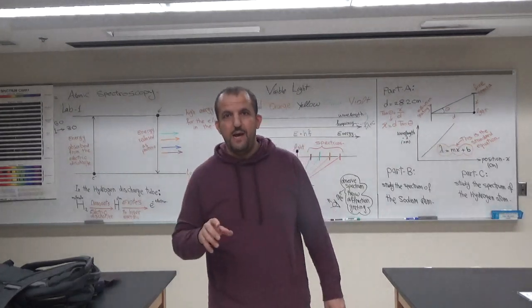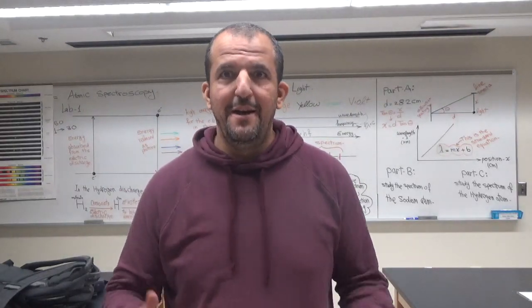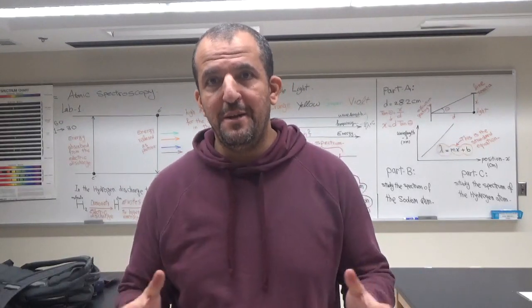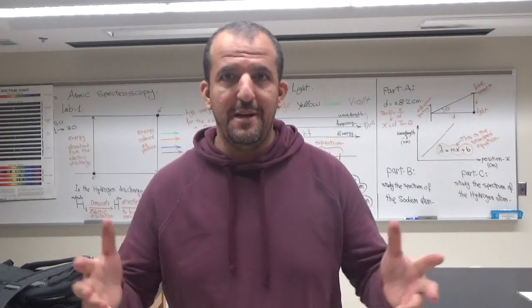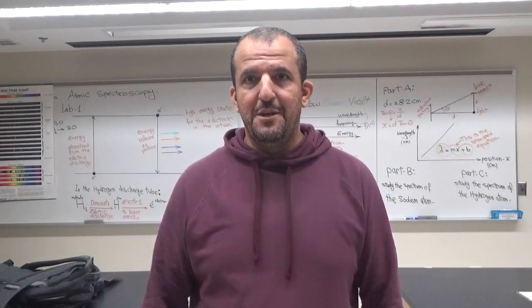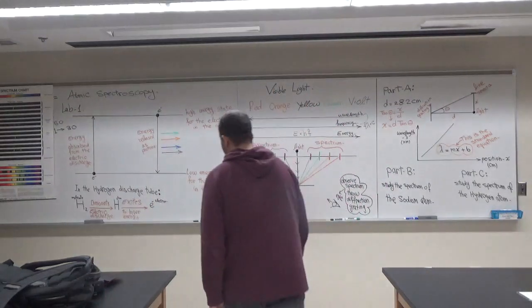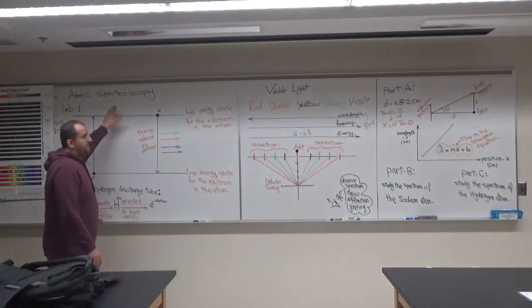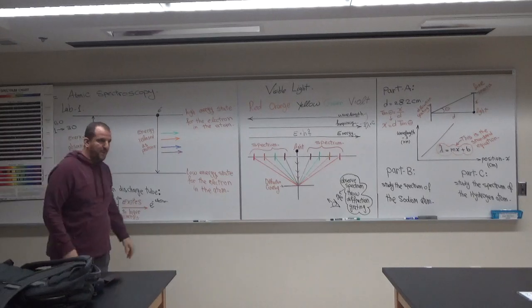So this is today's lab. I couldn't record the lab early. I just explained the experiment to you without starting the camera, so that's why I'm recording this session for you guys. So let's get started, and today we will talk about atomic spectroscopy.